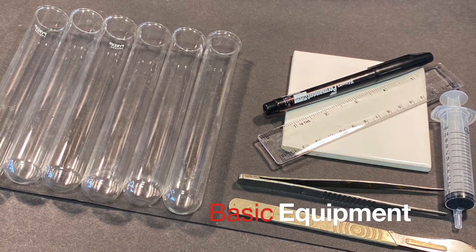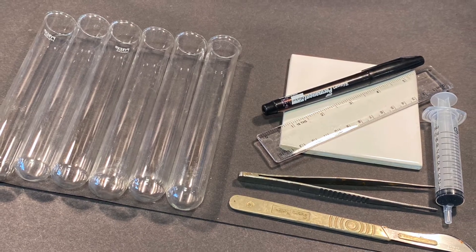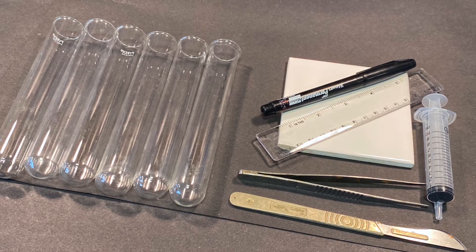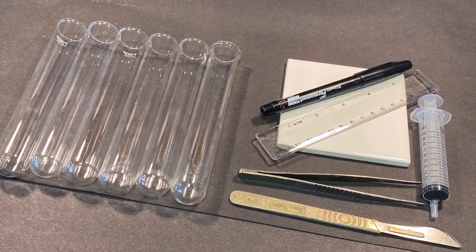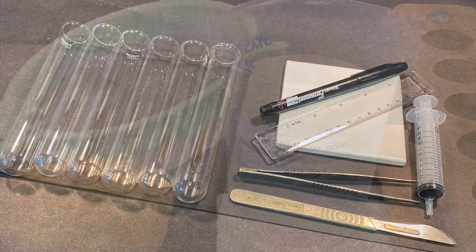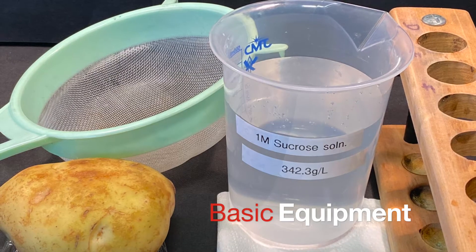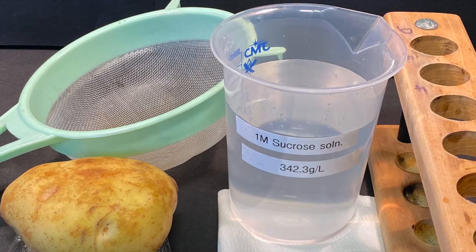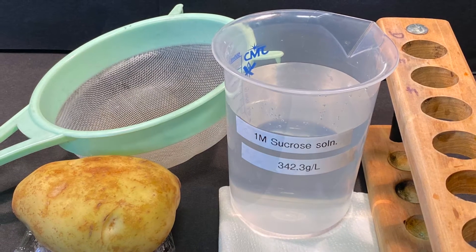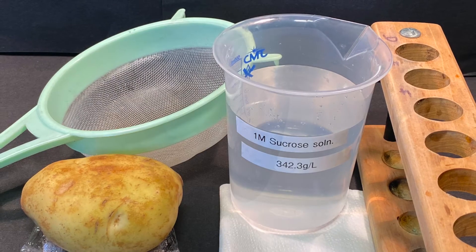To carry out the investigation you would be provided with the following items of basic equipment: boiling tubes, a marker pen, a ruler, a white tile, forceps, scalpel, and a 10 milliliter syringe. Other items will be a potato or potato chips, one molar sucrose solution, a sieve, some blotting paper, some cling film, and a test tube rack.